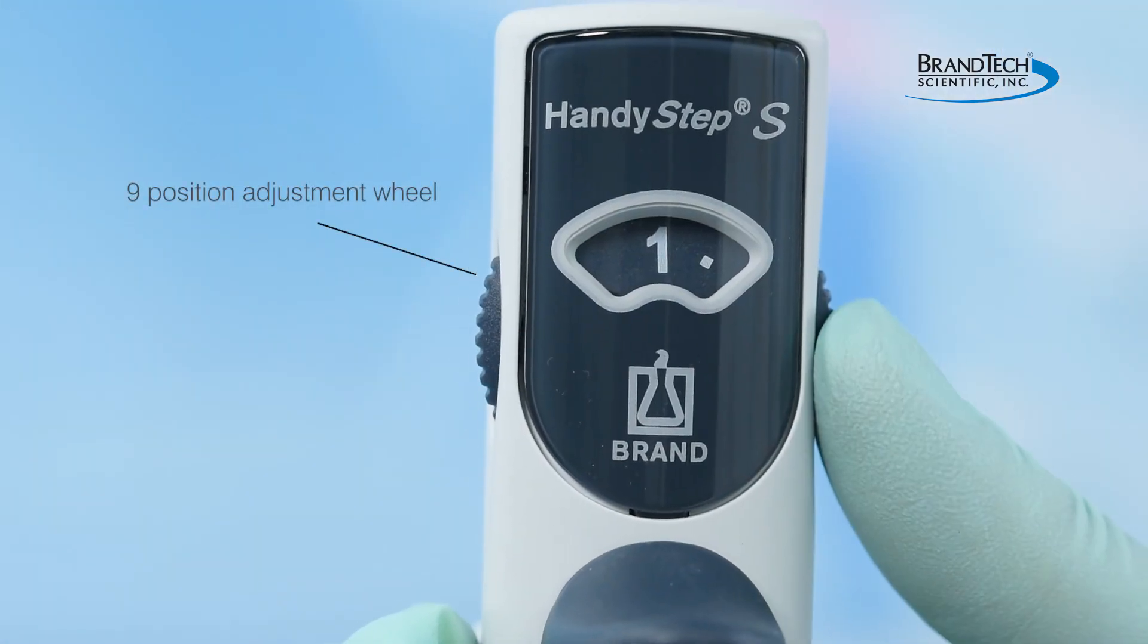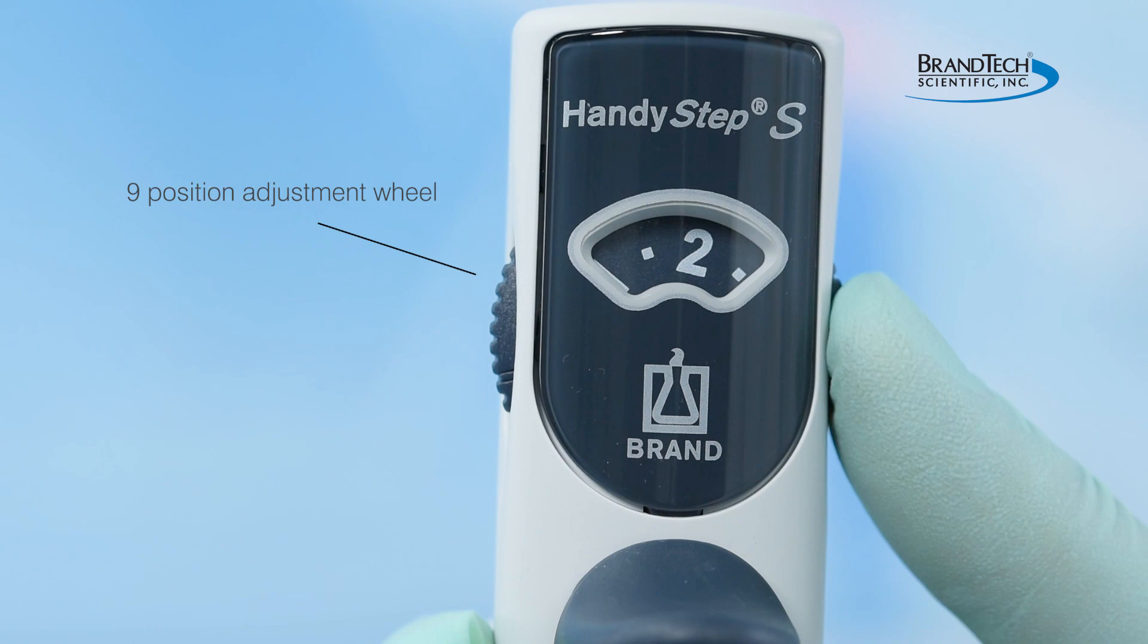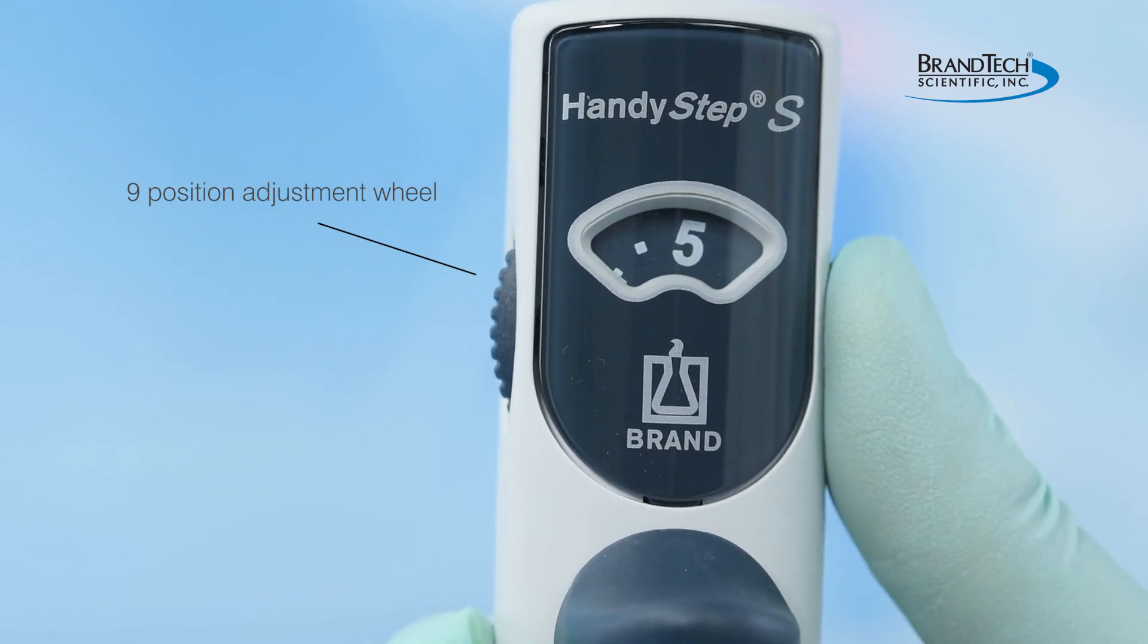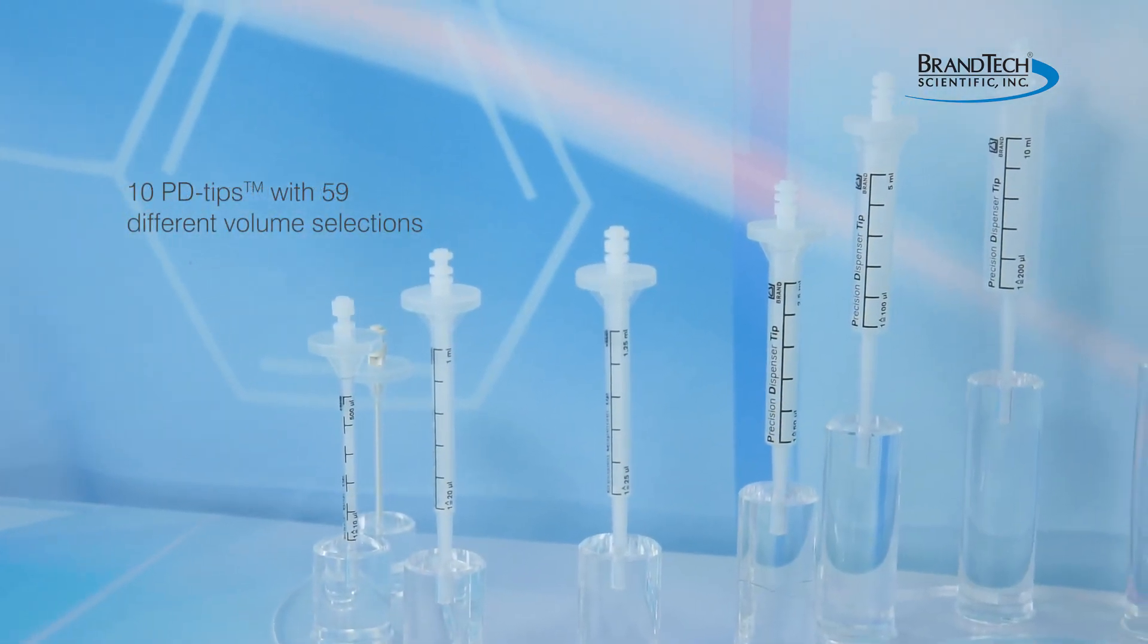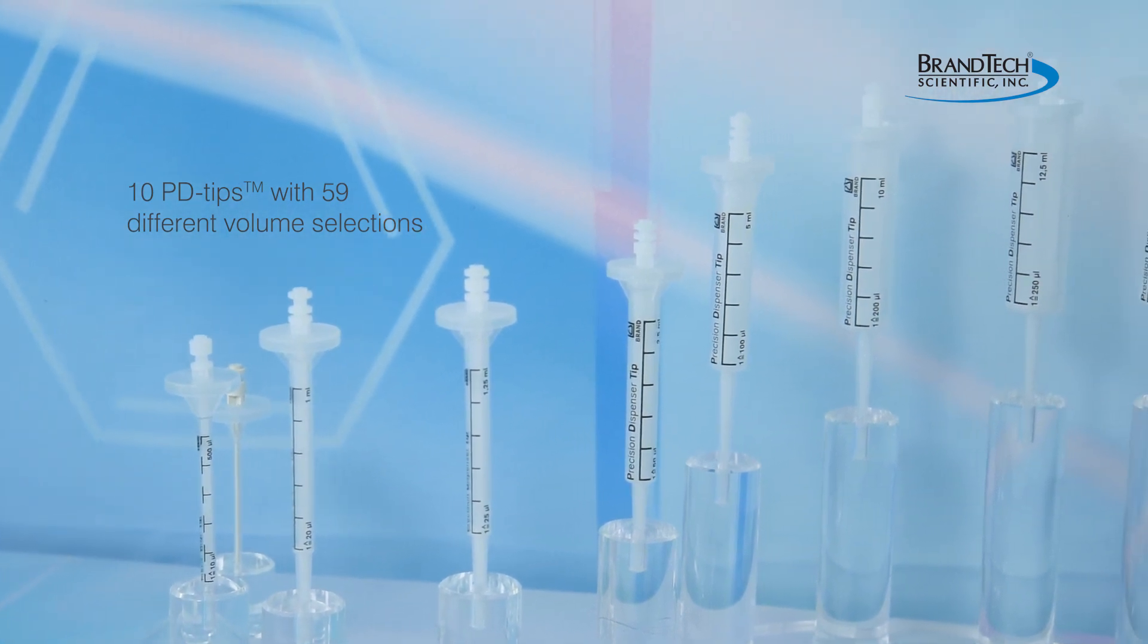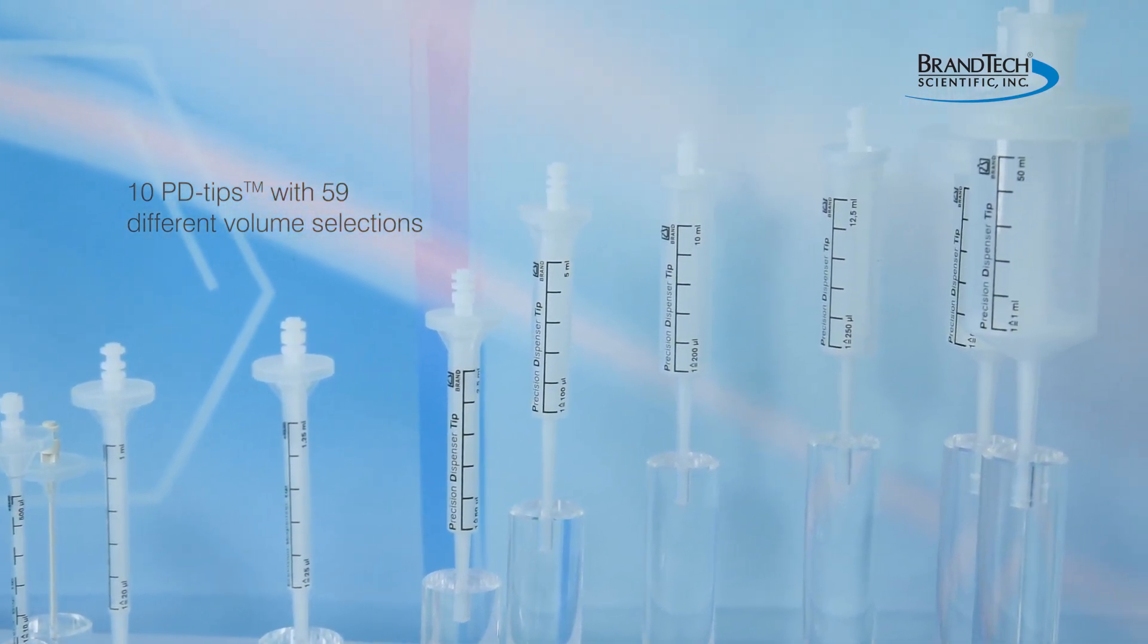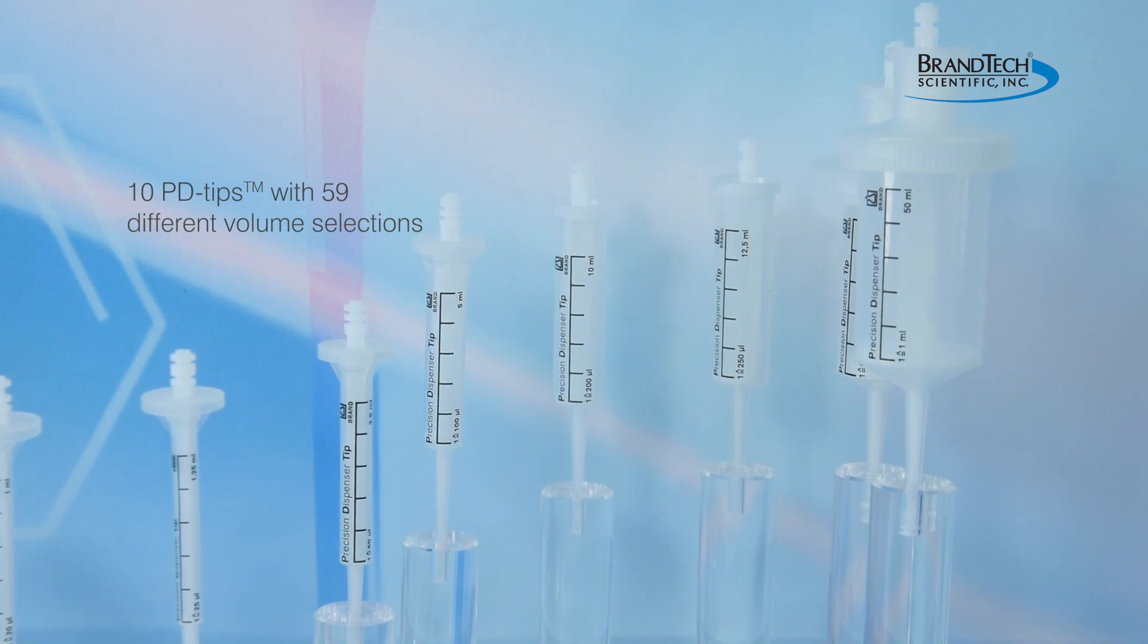The HandyStep S features a nine-position adjustment wheel with settings from one to five increments in half steps. When used in conjunction with the 10 different sized PD Precision dispenser tips, there are 59 different volumes that can be selected.